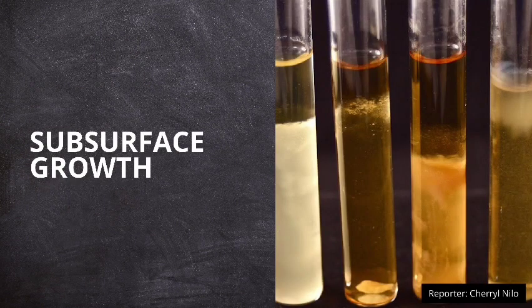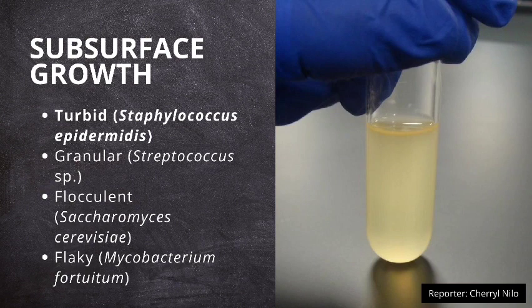The second characteristic under the bacterial culture in nutrient broth is the subsurface growth, wherein different organisms exhibit varying growth characteristics. First is turbid. It is cloudy.